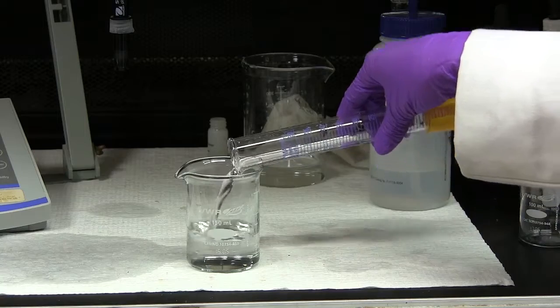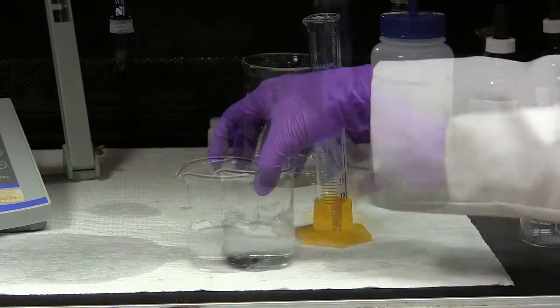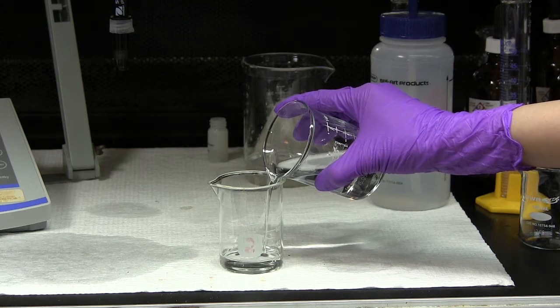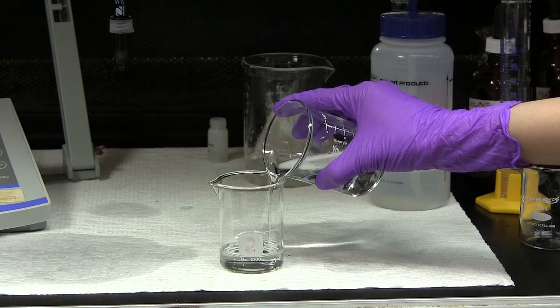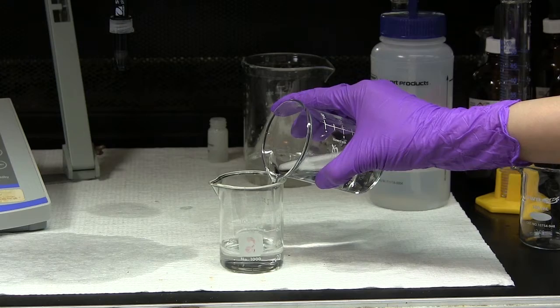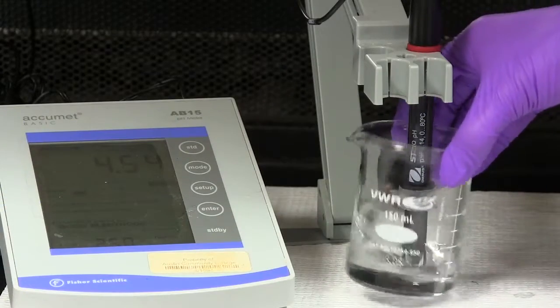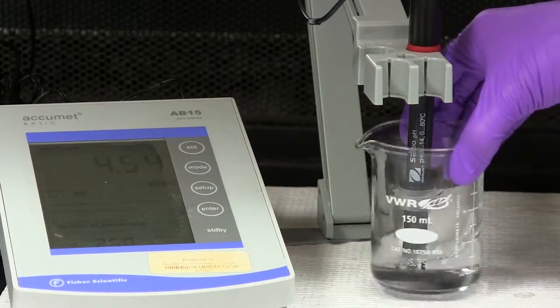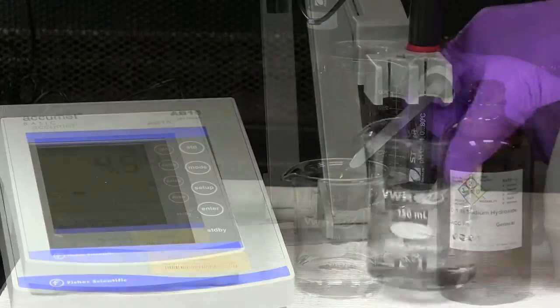Add 30 milliliters of DI water to the buffer mixture. Mix and pour half of the resulting solution into another 100 milliliter beaker. Measure the pH of the diluted buffer. Calculate pKa once again.